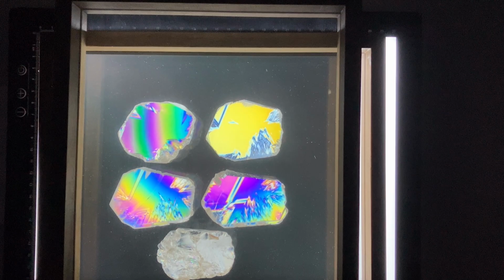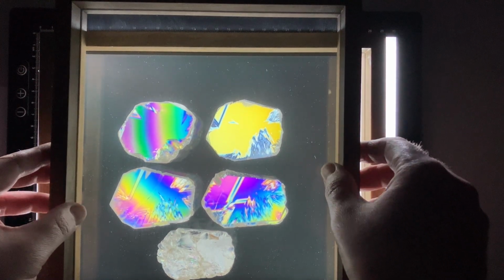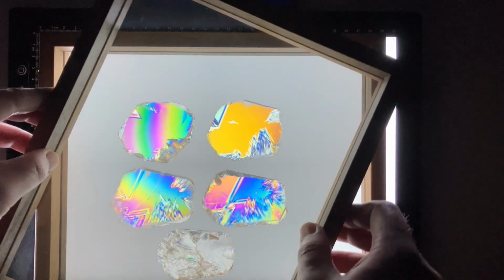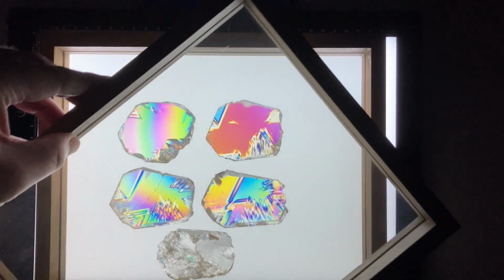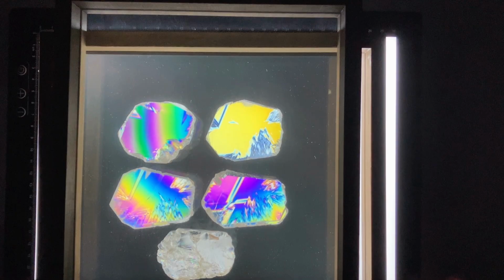Let's focus on our crystal slice in the upper right, which currently is starting out as yellow. And as we rotate our upper polarizer clockwise, we go from yellow to orange to red to violet to blue. For this slice of our quartz crystal, the spiral staircases are for the most part rotating counterclockwise.